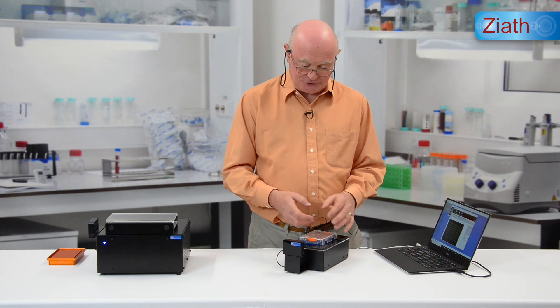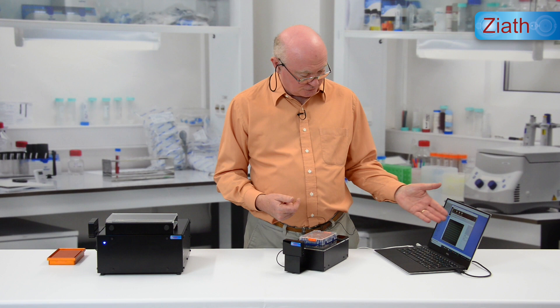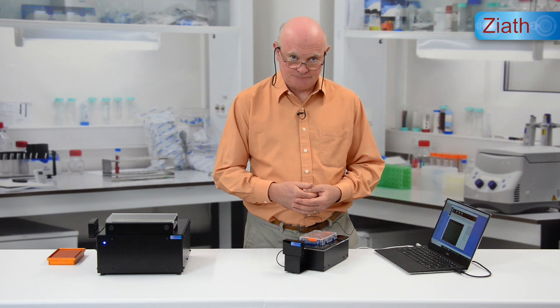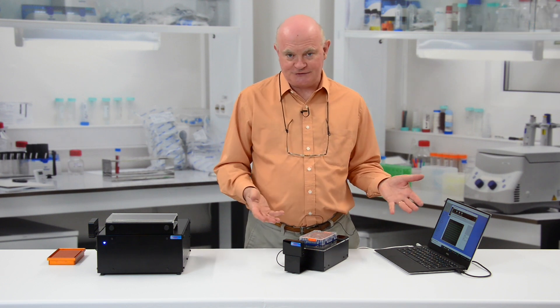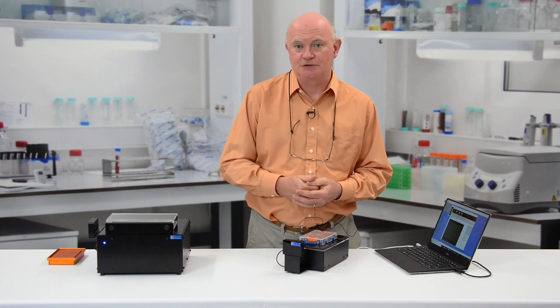They can be quite difficult to read, but even in this bright environment the Mirage has been able to decode all of them without the need to cover the rack. If you want more information about Ziath products — our pickers, our scanners, all the software — then please do visit the website at www.ziath.com.